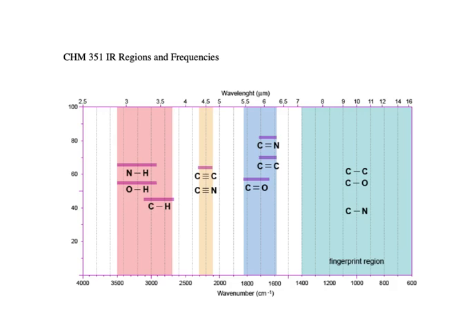So, the IR table. This is one of the handouts you will always get. The way I think about it, I really don't worry about the fingerprint region too much. When I'm analyzing an IR, I like to work from left to right. So I worry about NHs and OHs, which are going to be broad. Big and broad, right? They will not be sharp.